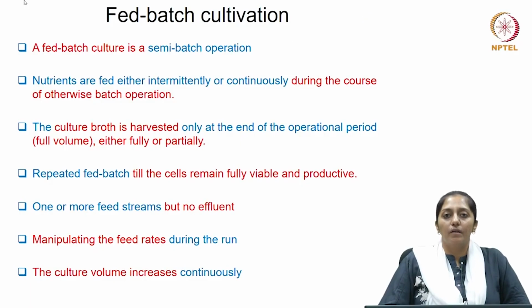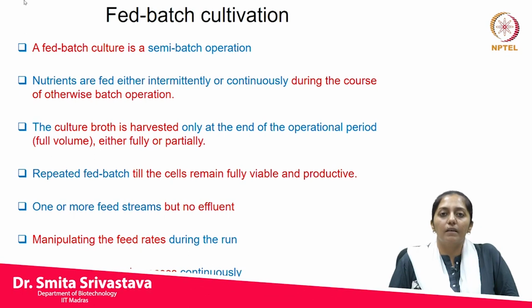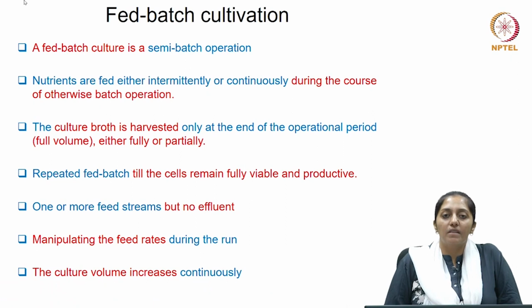Welcome back, students. So in the last class we were discussing design of batch reactors. Now in this class we are going to move ahead with the design of fed batch reactors. If you remember, in the introductory lectures I spoke about the different types and modes of cultivation, in which batch mode of cultivation was one, which we call batch reactors, and then there was fed batch mode of cultivation, and the reactors where fed batch mode of cultivation is done are also termed fed batch reactors. So let's see how to design a fed batch reactor.